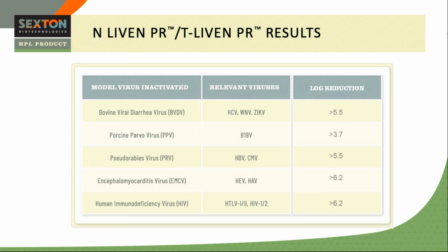Our findings demonstrated that we were able to successfully achieve an effective reduction of viruses in our products. Just to review these numbers, expectations in finished products state that log reduction in a range of 1 is not effective. Log reduction in the range of 2 to 4 is considered moderate to high effectiveness, and log reduction above 4 is a highly effective reduction process.